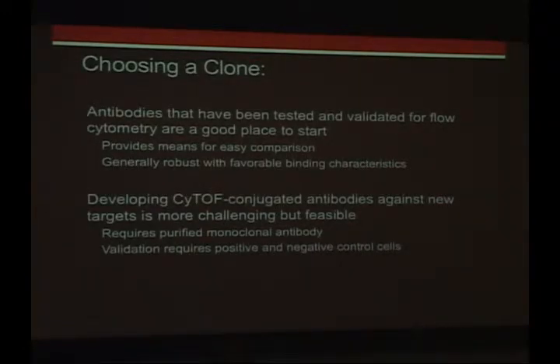So how do you choose the right antibody to label, or where do you start in terms of developing new reagents? And this is maybe a little less critical now that DVS, the company that manufactures the mass cytometer, actually does sell some commercially available reagents now. I made this talk before that happened. So choosing a clone might not be such a challenge if you're using commercially available reagents.